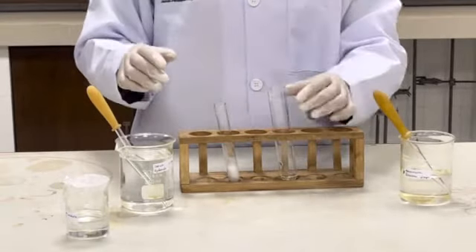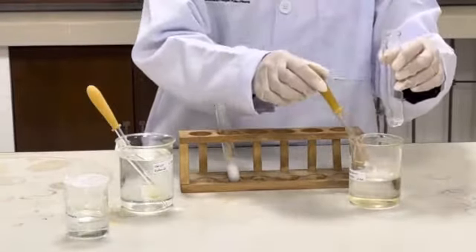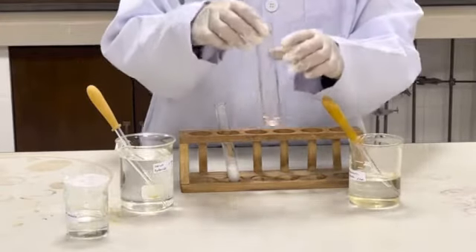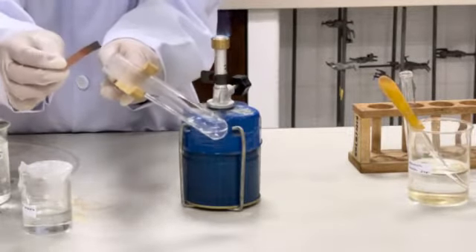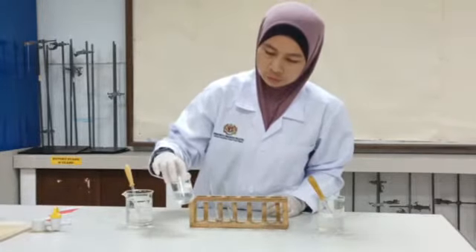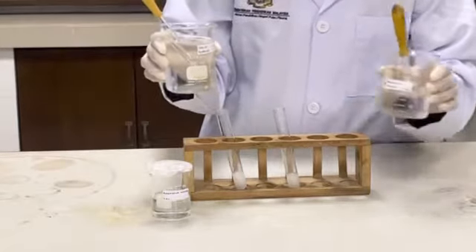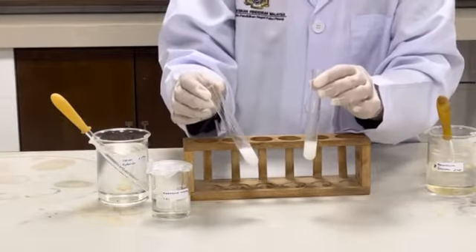Now we continue with the test with ammonia solution. We add only a few drops and there are no visible changes. If there are no visible changes, we need to heat strongly and test with red litmus paper, and the red litmus paper turns blue. Now we test the cation for magnesium nitrate. Here we have 2 cm³ of magnesium nitrate. When you test with sodium hydroxide and ammonia solution, the magnesium ion will produce an insoluble white precipitate.